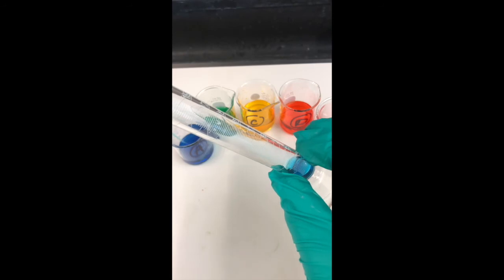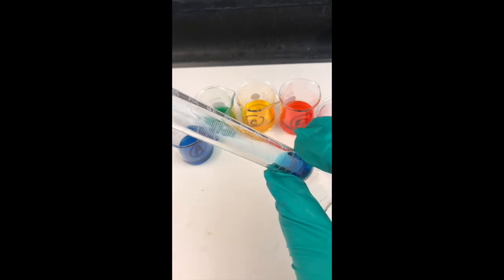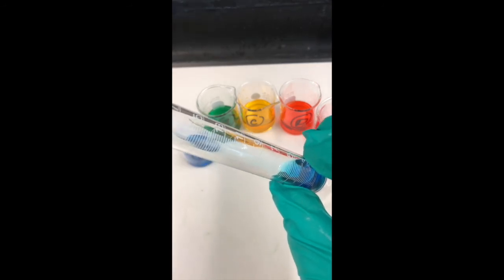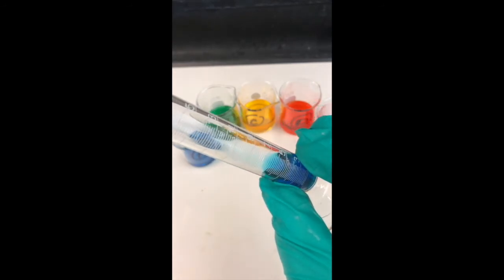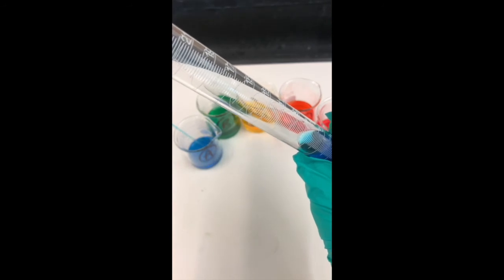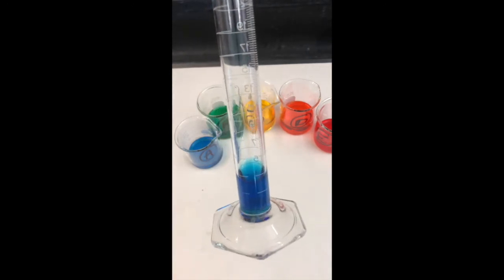You're going to want to get a decent layer of our blue, because this is going to be the cushion for when we start layering our green. So for the first one here, I say we'll add about 5 to 10 mils, which is about 5 squirts of this in here, giving us a nice first layer.